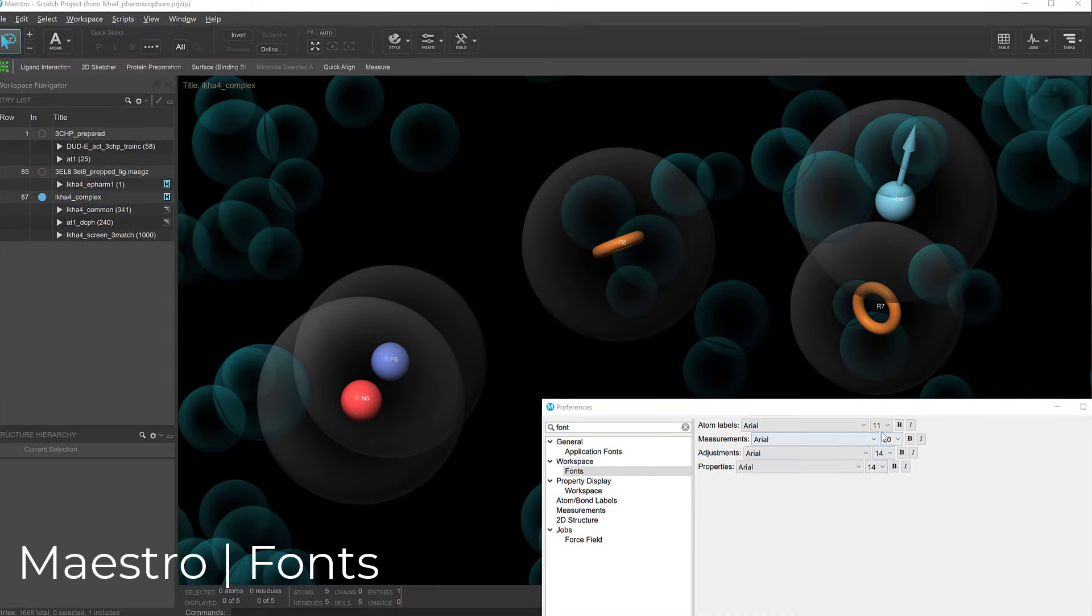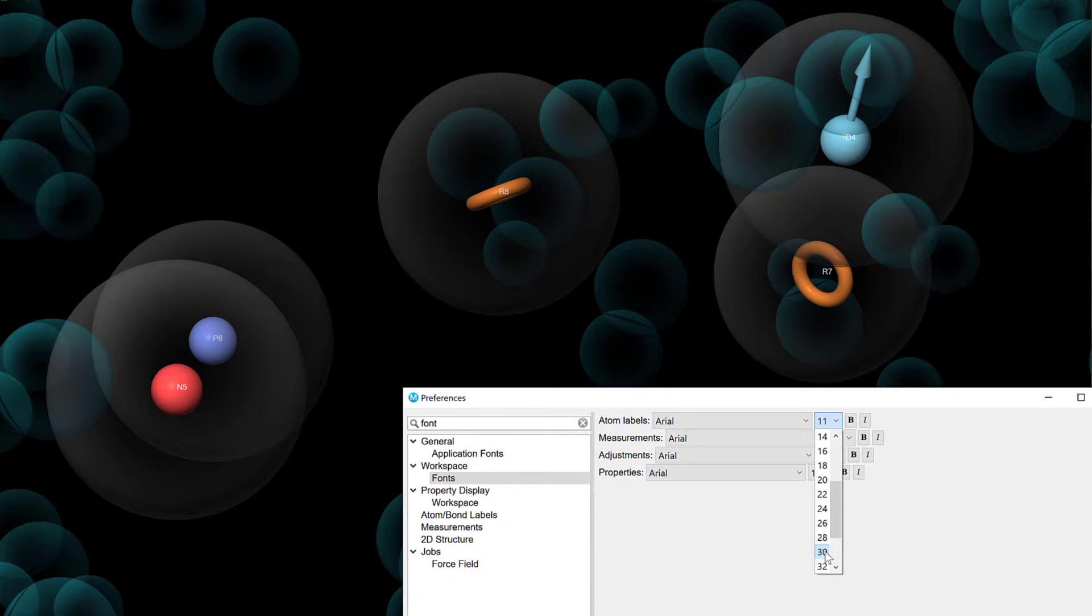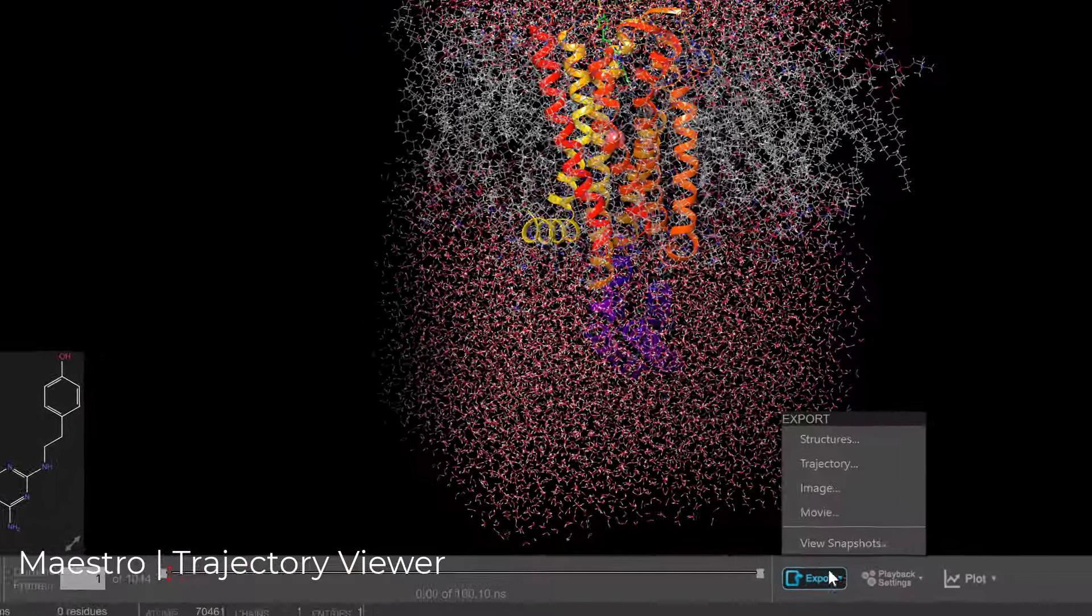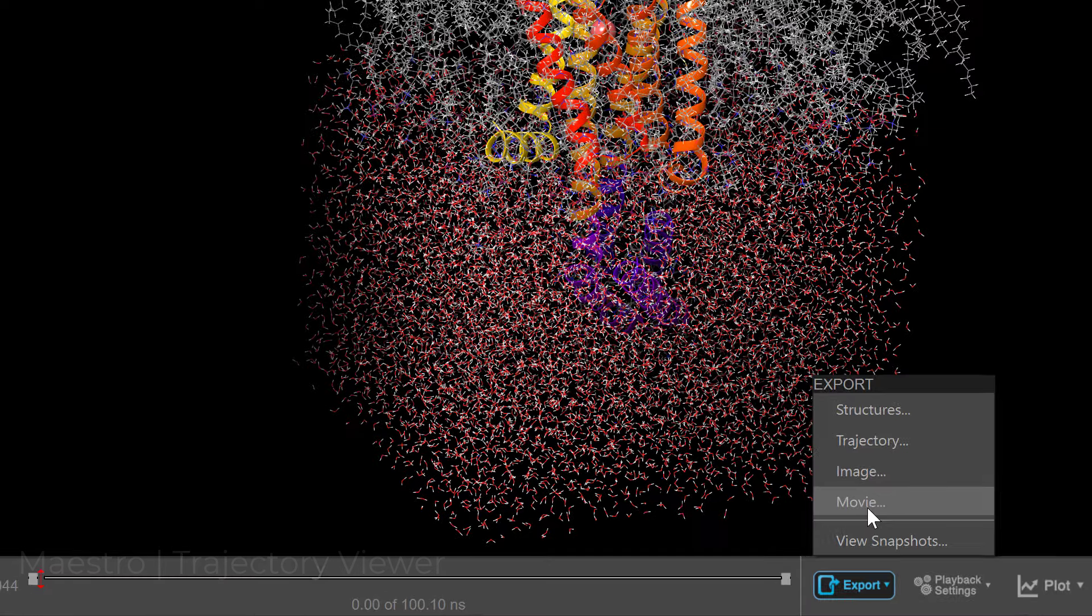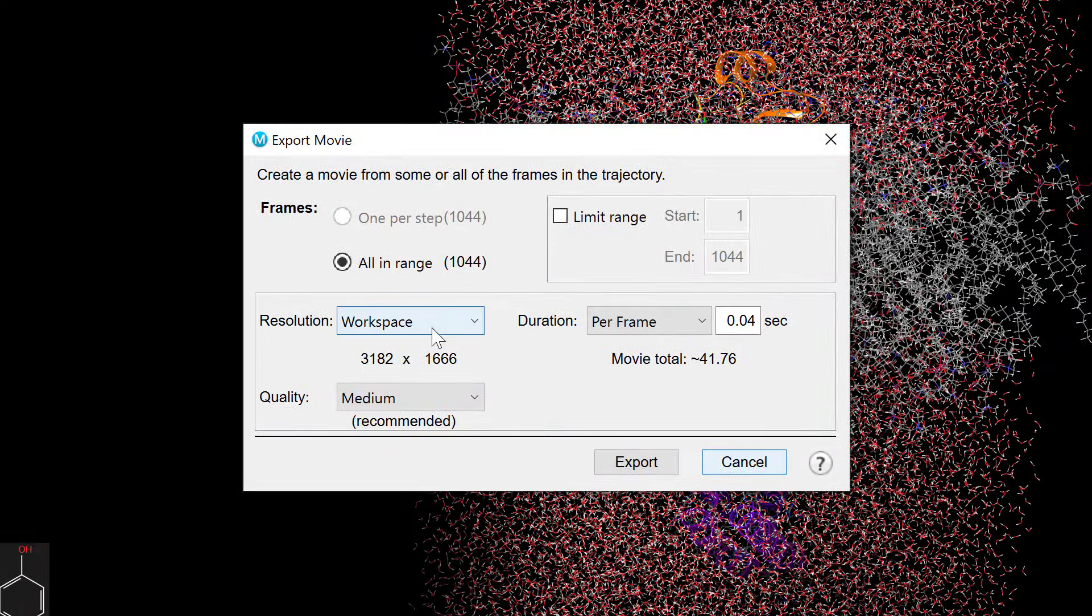In the workspace, the fonts for Pharmacophore labels can now be controlled via the Maestro font preferences. In the trajectory viewer, one can export movies while maintaining the resolution of the workspace.